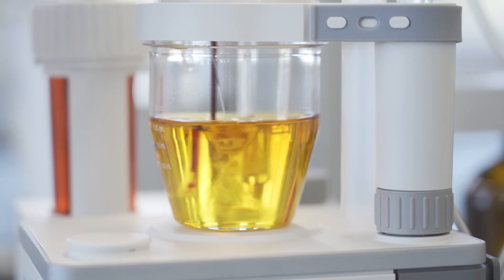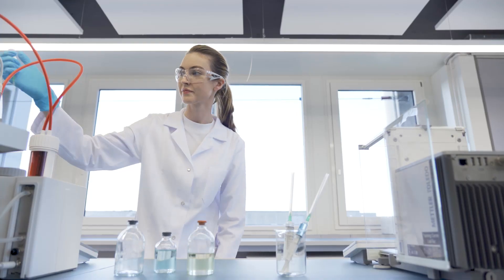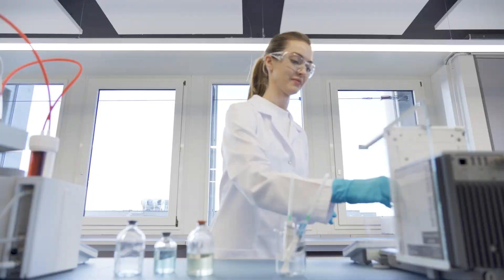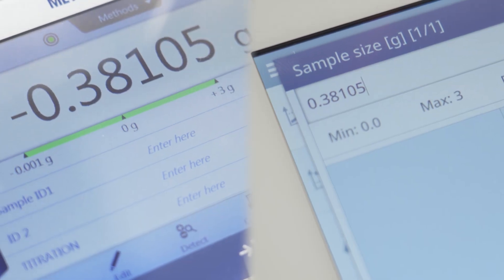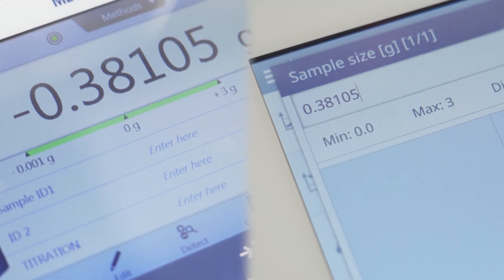The right sample size is crucial for an accurate result. With the METTLER TOLEDO balance, the process is straightforward. The sample weight is automatically transferred, which eliminates the possibility of transcription errors.